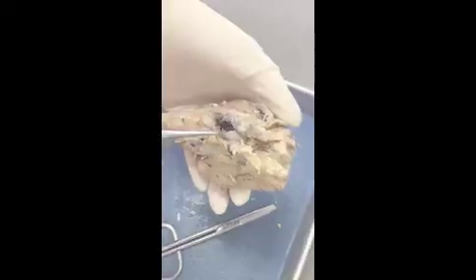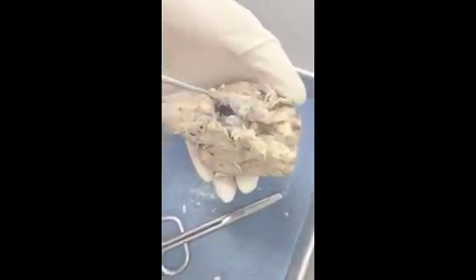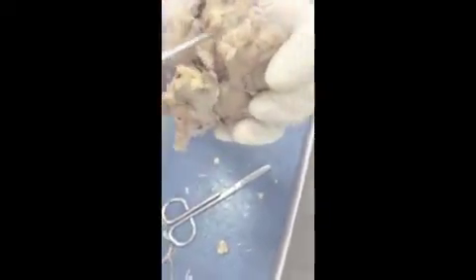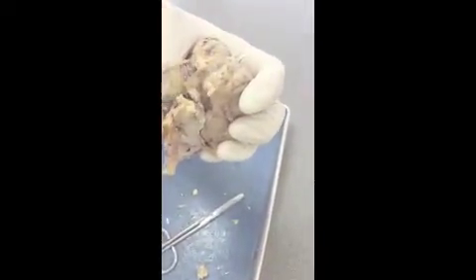The X-formed structure here is the optic chiasma, and this deals with sight. Here we can see that solid white portion is the optic nerve, which controls sight. These two flaps here are the olfactory bulbs, and the function of these is to help us smell.